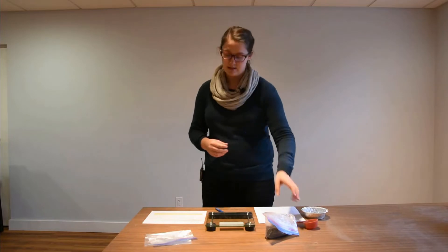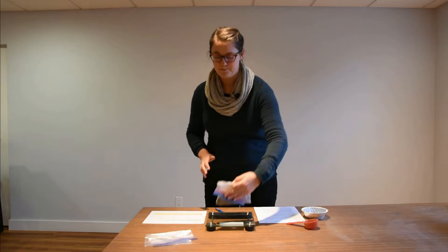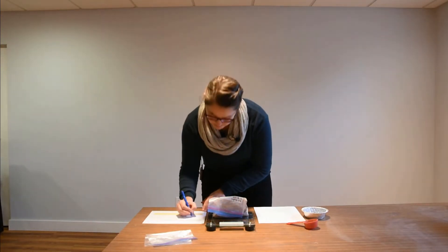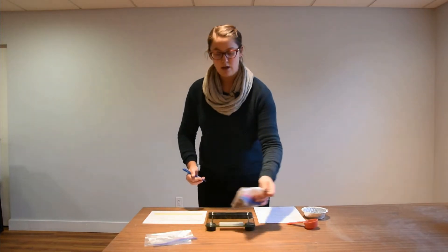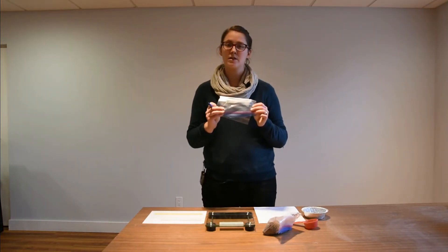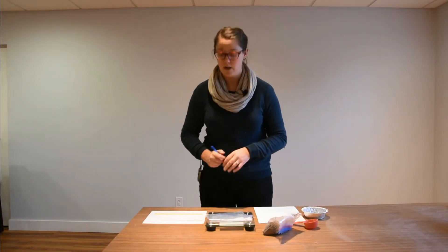You've collected your bulk density sample from the field and now it's time to take some weights and measurements to finish the bulk density calculation. The first thing you want to do is collect the weight of your field moist soil plus the bag weight — this one is 253.5 grams. You also want to know what the weight of that bag is, so take the same type of bag you used and weigh it as well — this one is 5.5 grams.